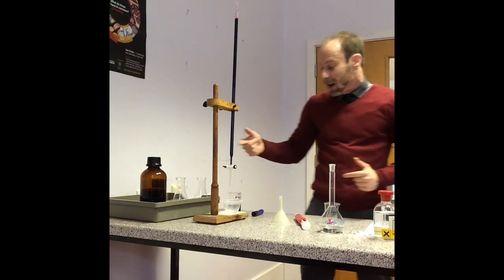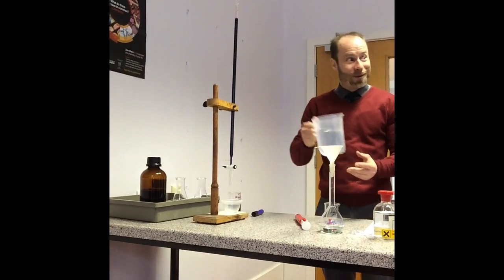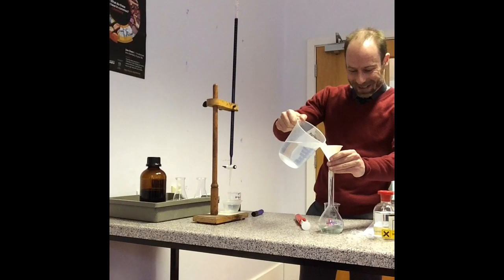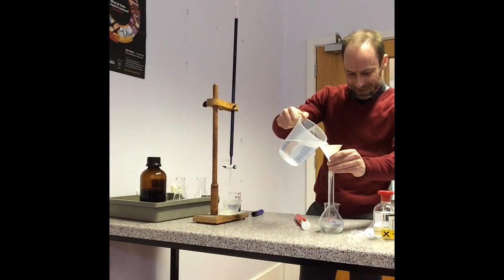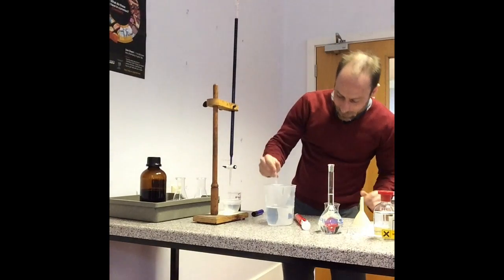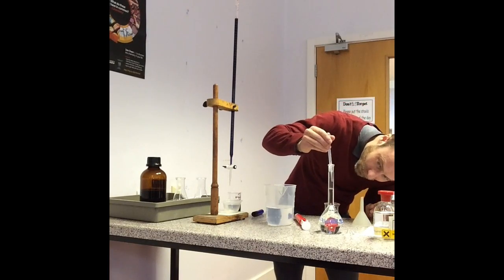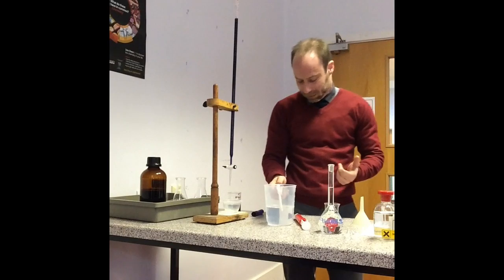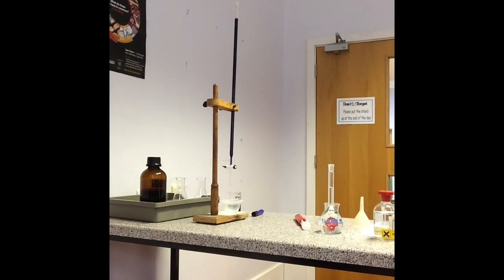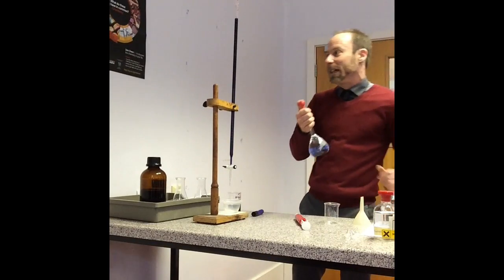Right, so while that's doing, I'm going to top this up with some distilled water. And then, as ever, I do the final little bit with a pipette just to make sure it's all okay. There we go. Right, and then I'll shake this up just to make sure it's all mixed nicely.